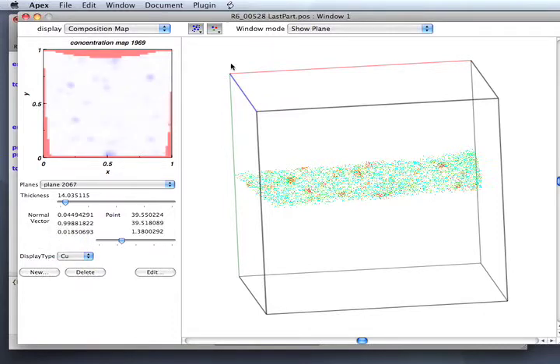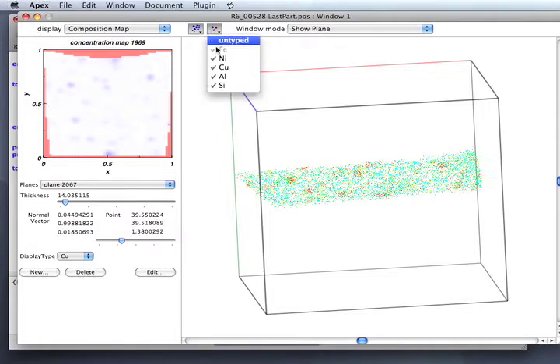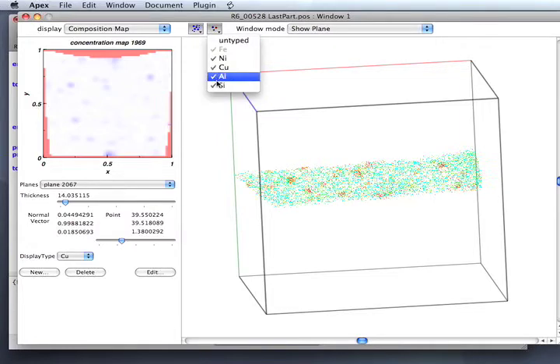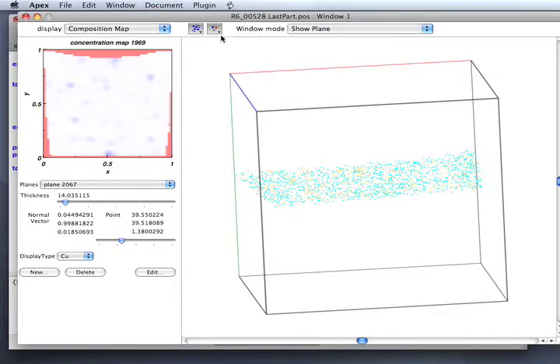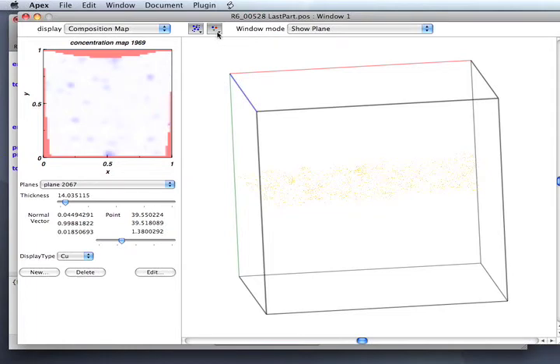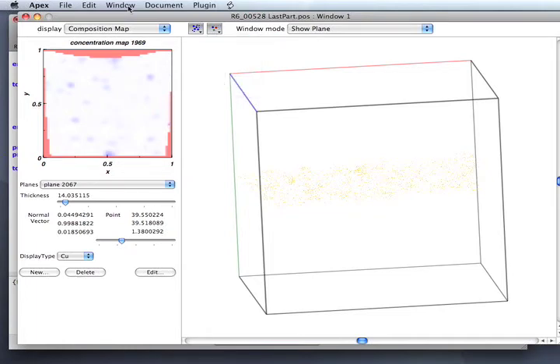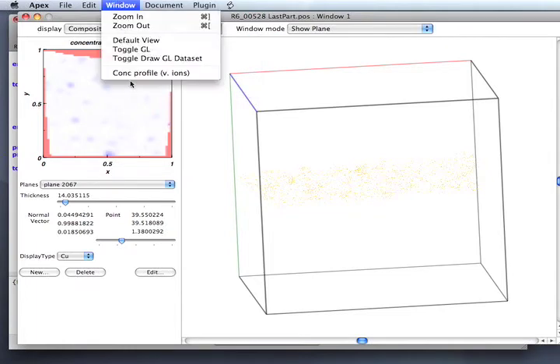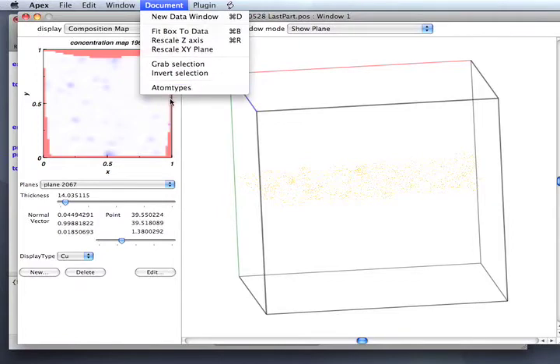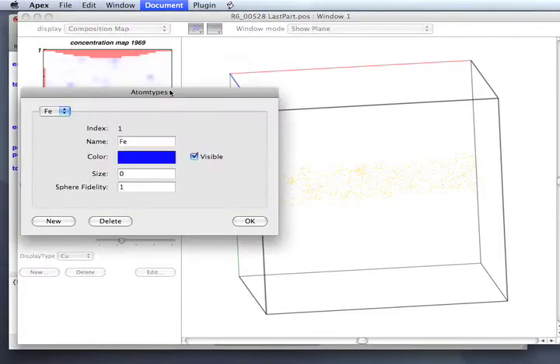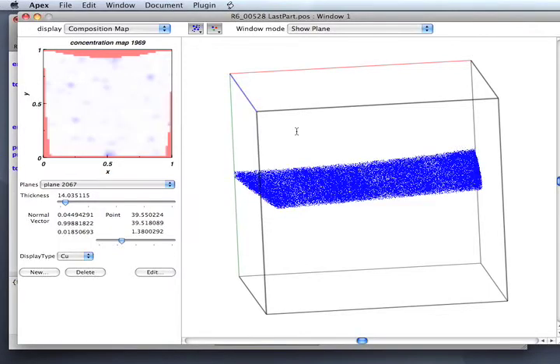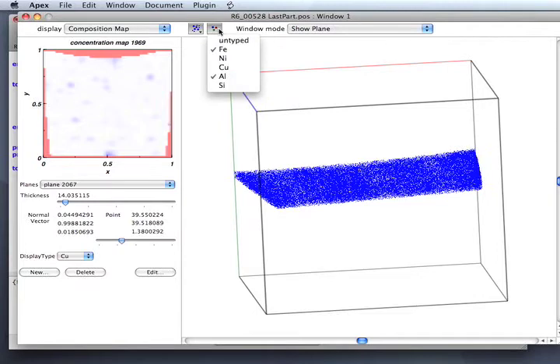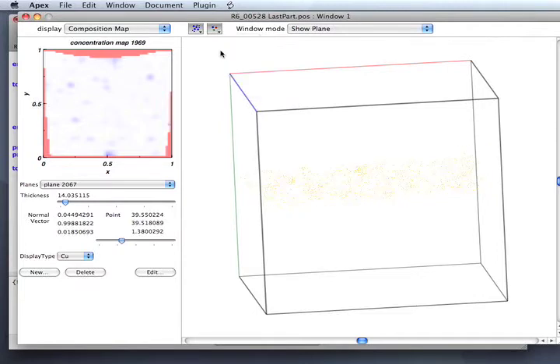I'm going to show also this item which controls the display of the various types. So I can turn off the nickel atoms, turn off the copper atoms, turn off the silicon in the display. Now this iron is disabled. Why is that? That's because the iron is set to be zero in size. If I change that to one in size, you'll see them now show up and I'll be able to turn them on and off as well.